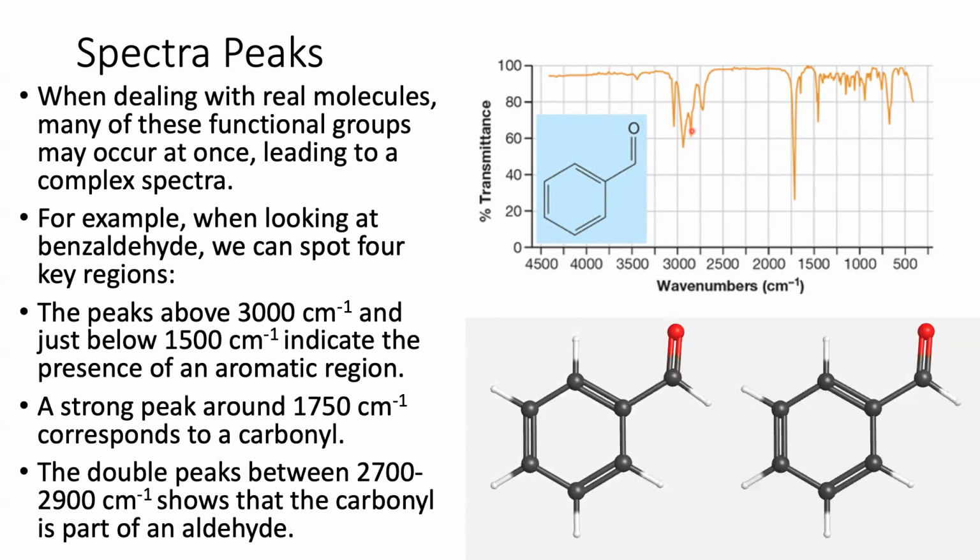So at the very least, I know that I have an aldehyde and an aromatic. One of the things that's also worth noting is what you don't have. Note that I don't have a lot of absorptions in this 1000 to 1400 region, so I don't have a lot of essentially alkane carbons. Not enough to be definitive, but that would indeed agree with a benzaldehyde. So again, you may note that this IR is a very good confirmation technique of what you expect. It can also let you know if something got in that you weren't expecting, in case you see any unexpected peaks.